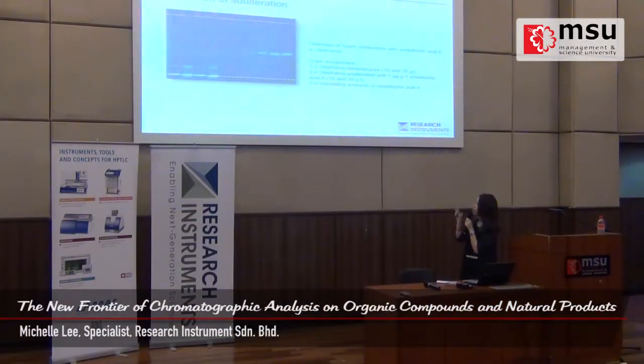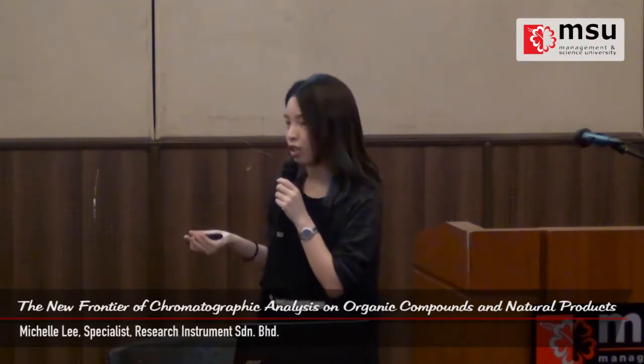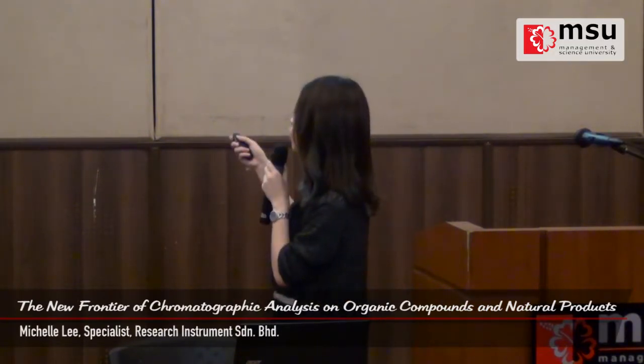And then this one is another application, which is an adulteration test. This raw material, this herbal drug, is called Stephania tetrandra. It has a lot of herbal uses; it is therapeutic and can treat a lot of diseases. But what some people do is try to substitute this plant with another species and sell it at the same price. This is what we call the adulterated one.